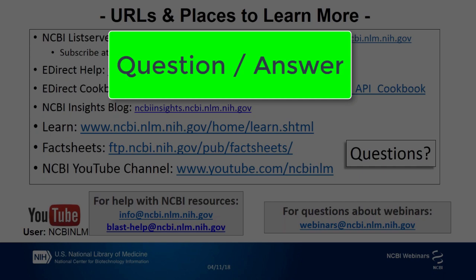But there's another problem with these programs, like eFetch in particular. There are basic physical limits as to the number of IDs that it can process. And so if you're in the areas of hundreds of thousands, your request probably won't work. So, if you're going to do that kind of retrieval, you'll want to work with smaller files. If you do things like submit multiple requests simultaneously where you're hitting the web servers thousands of times a minute or something like that, yes, we will block you based on the IP, but eFetch will fail with large numbers of IDs.